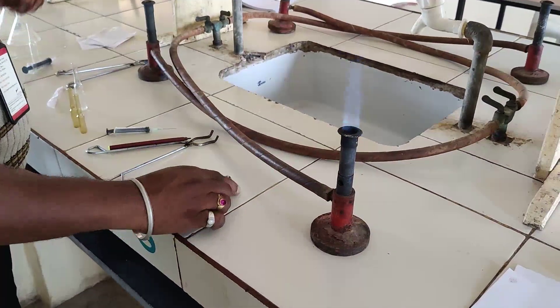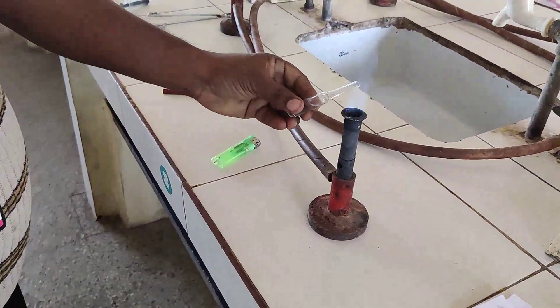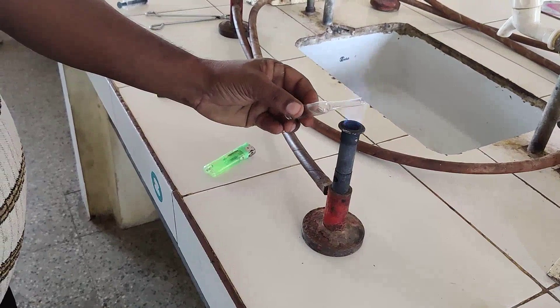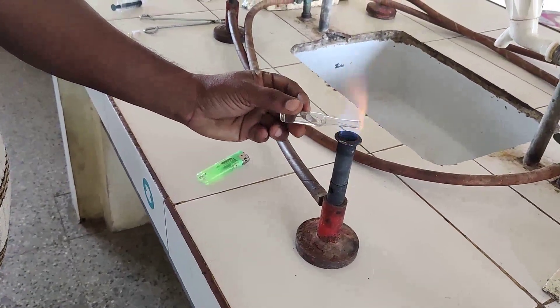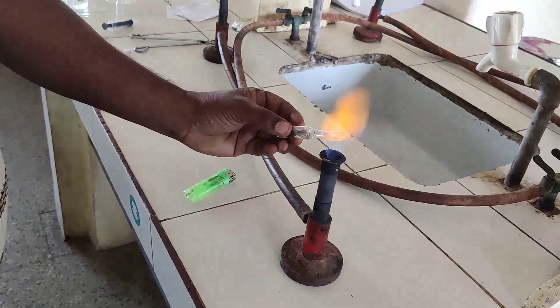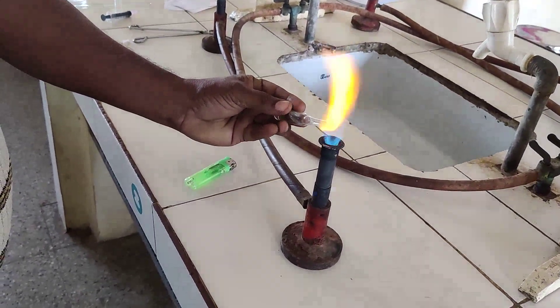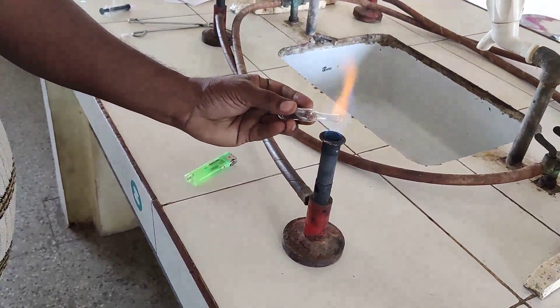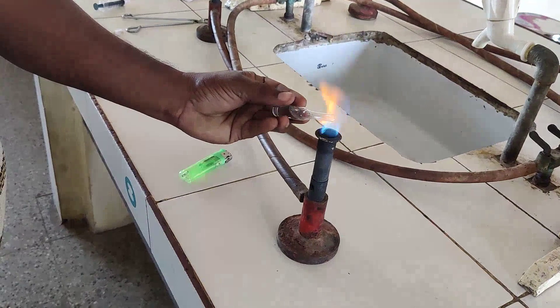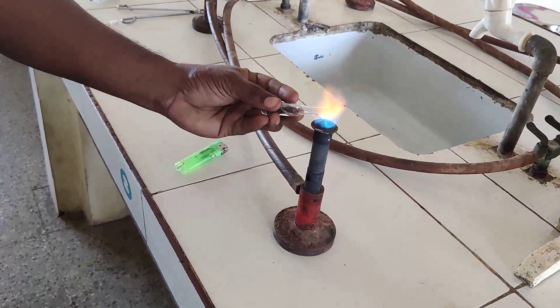Start the gas burner and place the ampule in a tilted position in the flame. Rotate the ampule so that uniform heat is applied to all portions of it. Place the ampule in the burner until the neck portion becomes red hot. After that, pull the neck portion of the ampule with the help of a forcep or pair of tongs so that the ampule gets sealed.